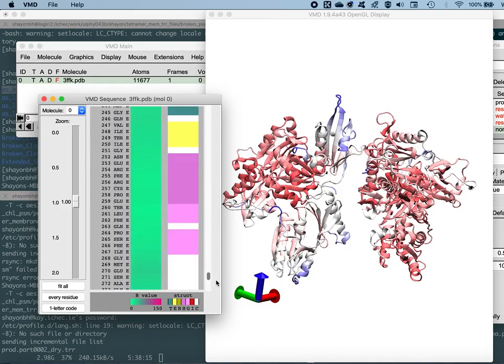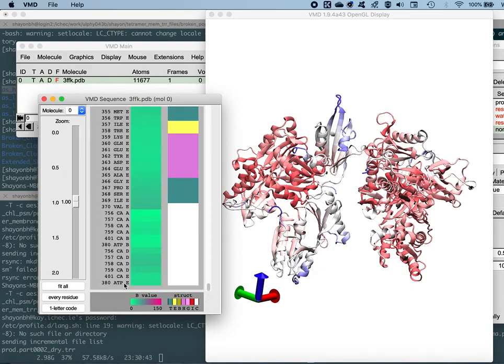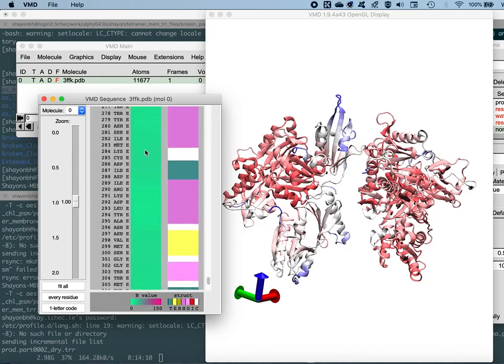And then further down, if you go down, down, down, you have one ATP molecule and all the calcium ions also designated around here. So all of these are represented by the color code of this column out here, which is the B value. So the B value here ranges from, as I said before, from 0 to 150. But you see, most of the colors barely reach up to the scale of, let's say, 75 even. So once it crosses 75, it would go down towards the red shades, but it doesn't actually. So most of them lie around the green shades out here.